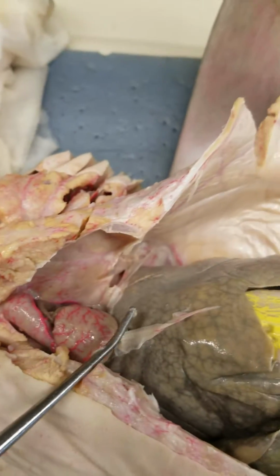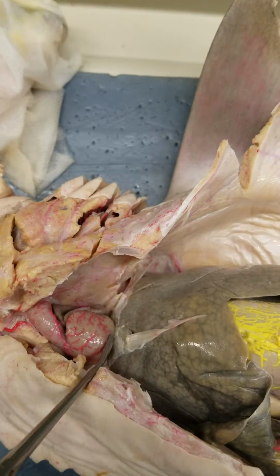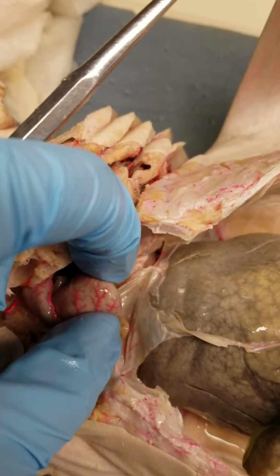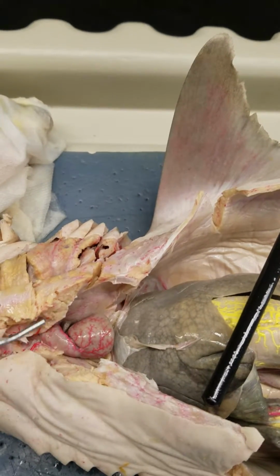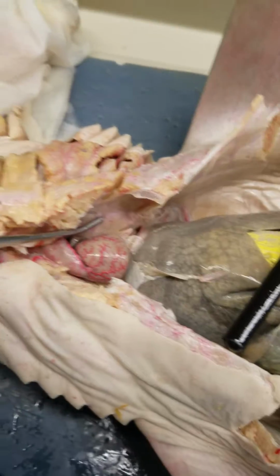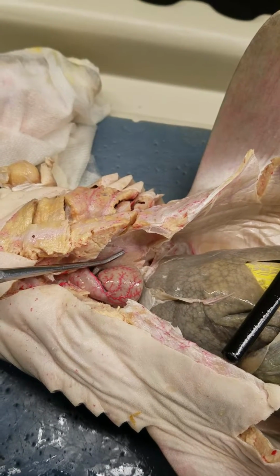And then so your sinus venosus should be just right under your heart here on this bottom part. So then if you move your heart out of the way, you can see your transverse septum there. Then covering the heart, we have the visceral pericardium. And then lining this inside of this cavity where the heart is going to be your parietal pericardium.